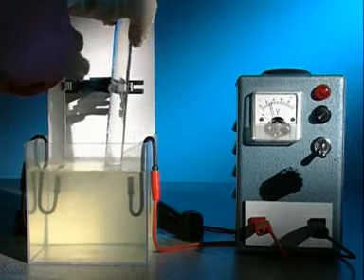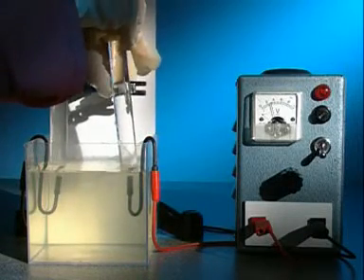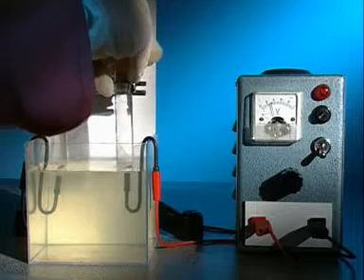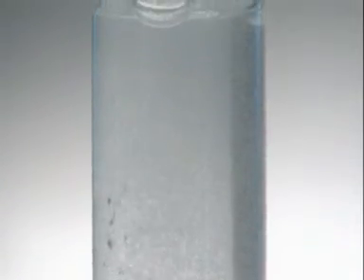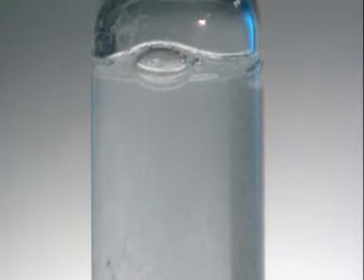To collect the gases, a test tube full of sodium chloride solution is placed over each electrode. Gas displaces the solution and collects in the top of the tube.